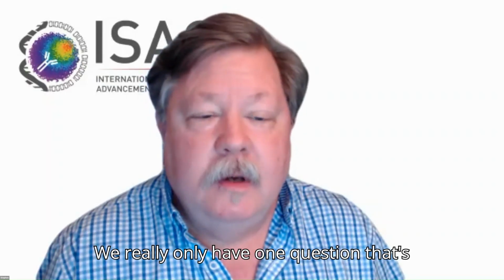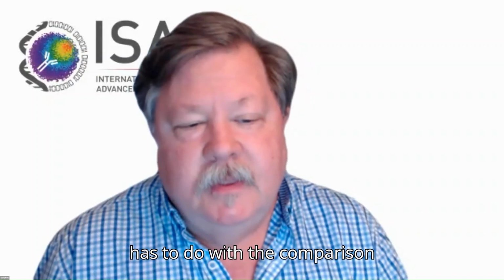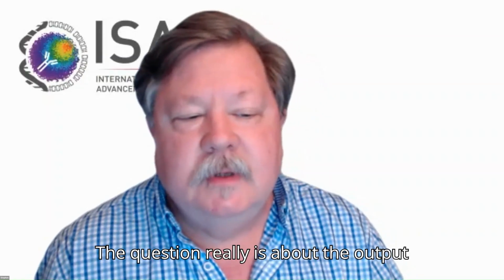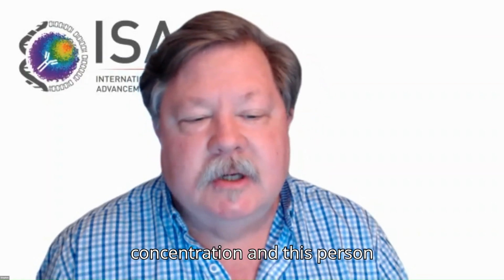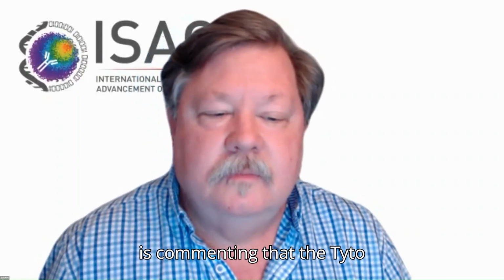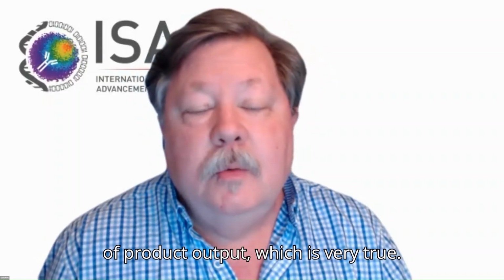We really only have one question that's come in so far. If anybody else has more, please type them into the question and answer box. Our first question has to do with the comparison slide and really microfluidics. The question really is about the output concentration, and this person is commenting that the TITO does have a fairly high concentration of product output, which is very true.